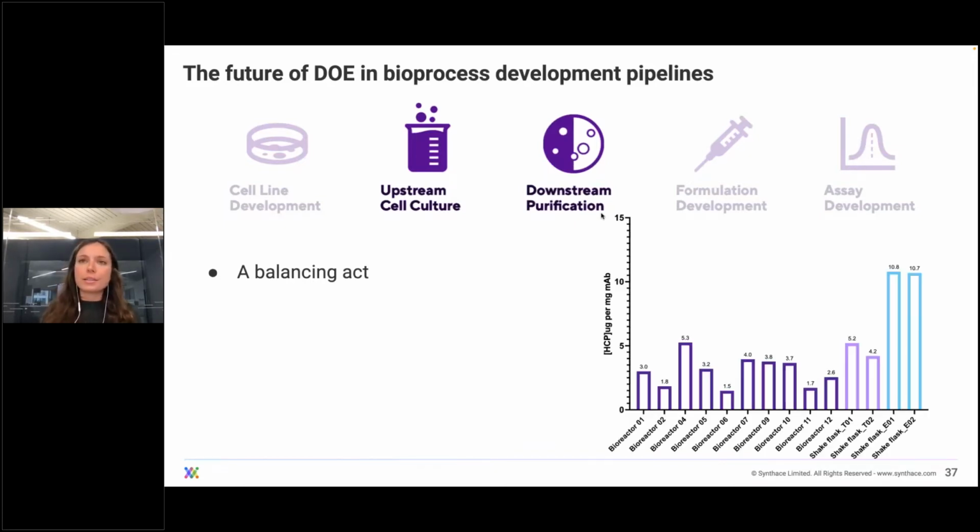And here in this small plot, you can see that though the differences between the different bioreactors weren't particularly huge, there are definitely variations. And you have to remember, we didn't look at such things as media composition, and you can imagine that having a really significant impact.